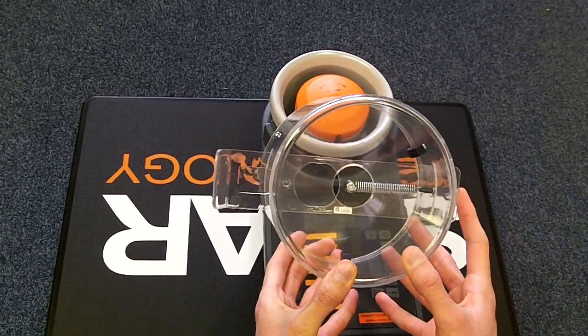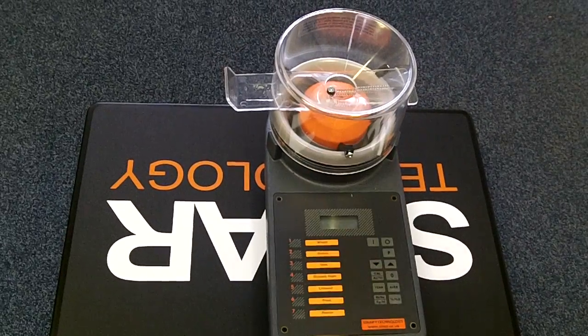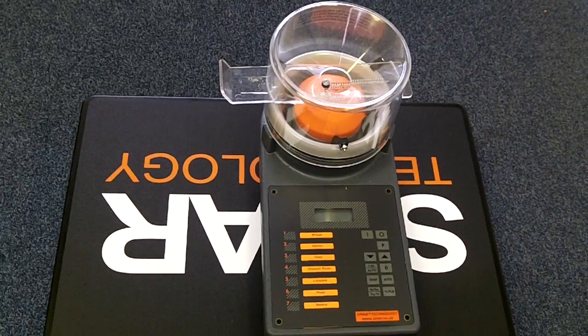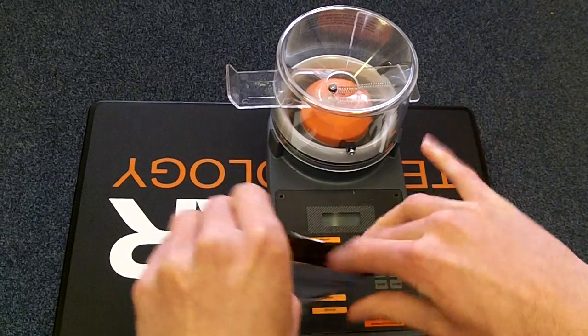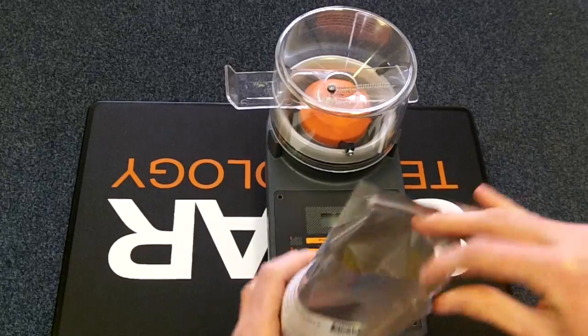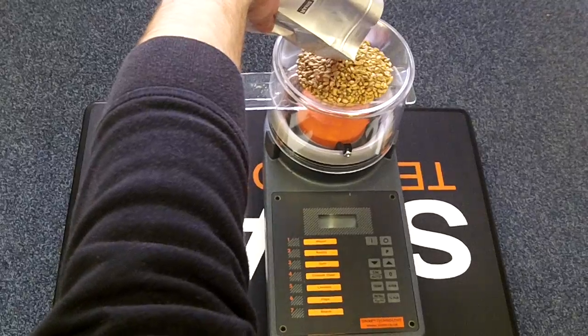Close the slide on the filling hopper and place this on top of the instrument. Take the calibration sample and pour this into the filling hopper, being careful not to lose any grain as it's a pre-weighed sample.